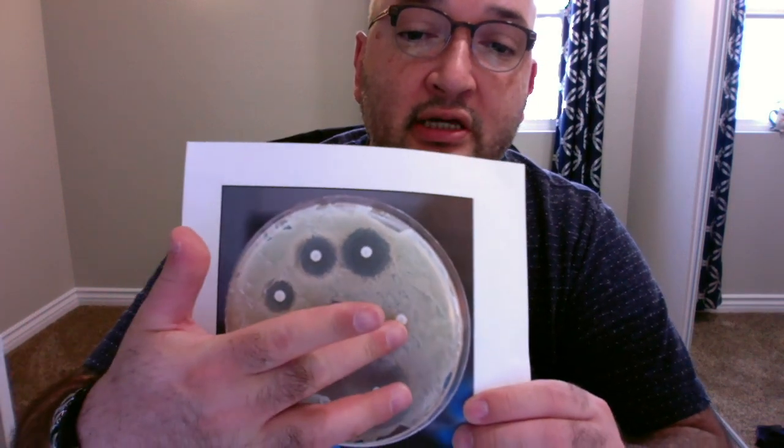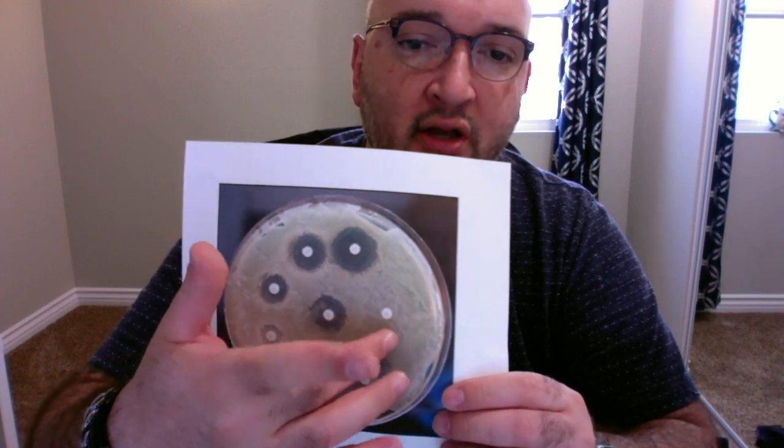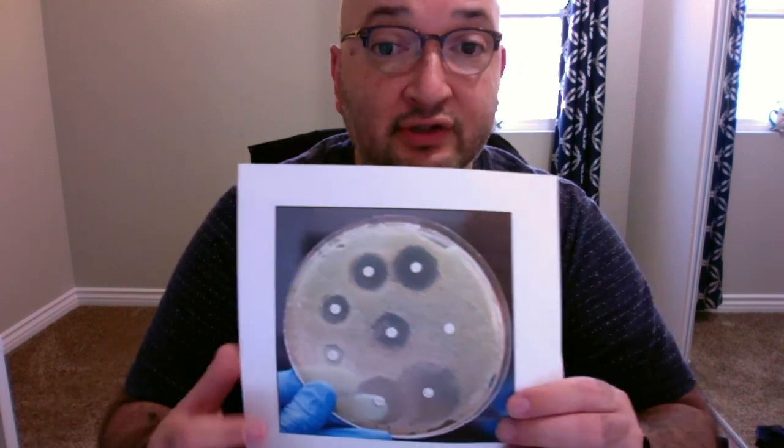If, for example, like in this case right here, there is no zone of diffusion, whatever this antibiotic is has no inhibitive properties against this bacteria, so this bacteria itself is resistant to that antibiotic.